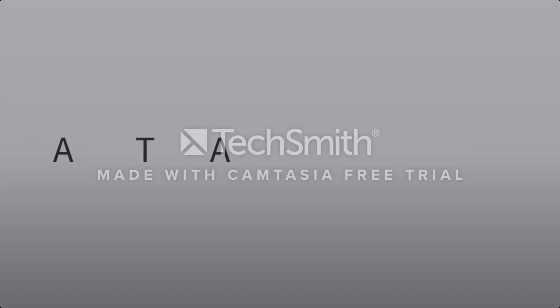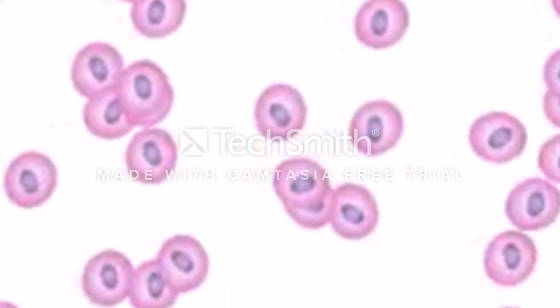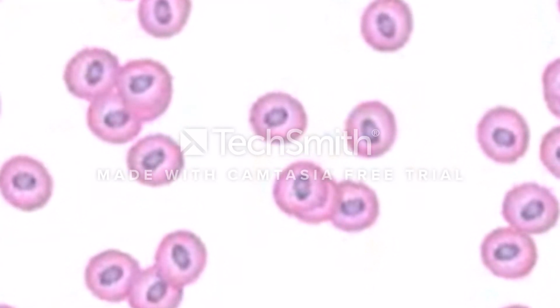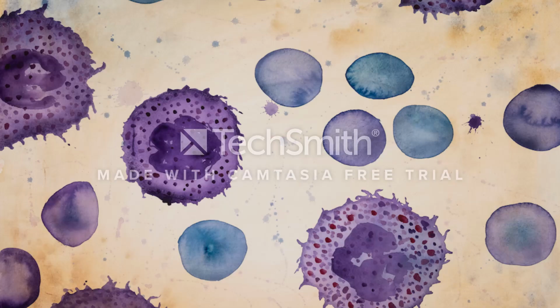Now, as we have understood how the available data is structured, let us have a closer look on the dataset. A plethora of image data is available as a part of the challenge on the website with various representations. Some examples from the 2D data include images for hematopoietic cells or muscle cells of a mouse, which describe fundamental processes of blood cell development and immune response, or to study cellular process involved in muscle development respectively.